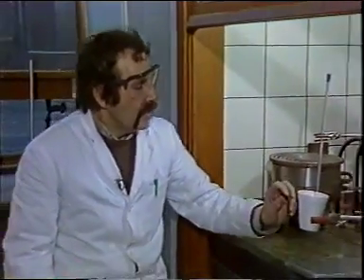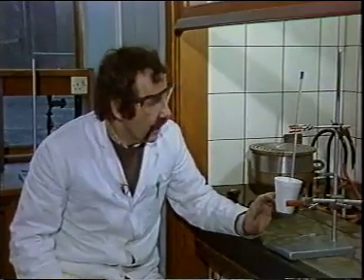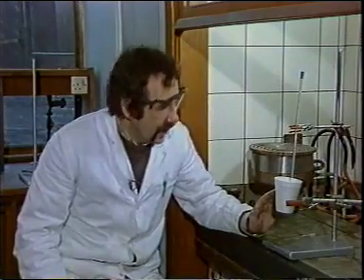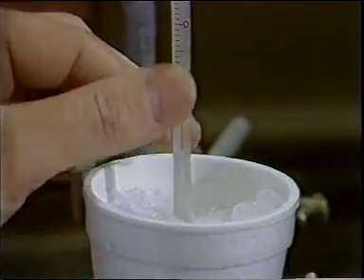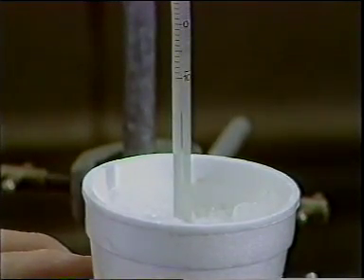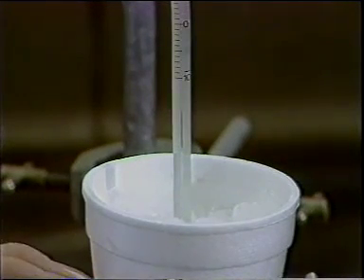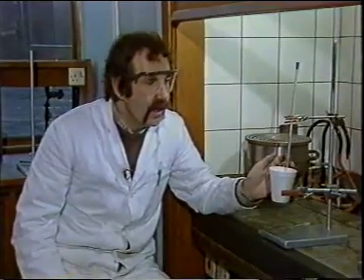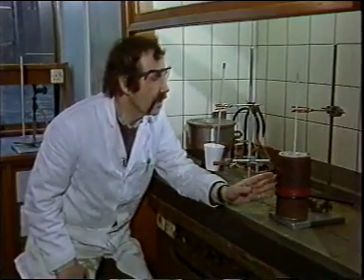If we need temperatures between 0 and -20, these are easily generated using a mixture of ice with an inorganic salt. Here we have a salt-ice bath, and you can see that the temperature is well below minus 10 degrees. If we need lower temperatures, for example, minus 70, minus 80, we have to use a reaction coolant of this sort.